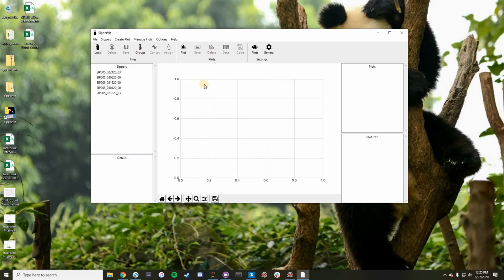Okay, in this video I'm going to cover just a few miscellaneous features of SipperViz which can help if you want to just kind of maximize the usability of this program.